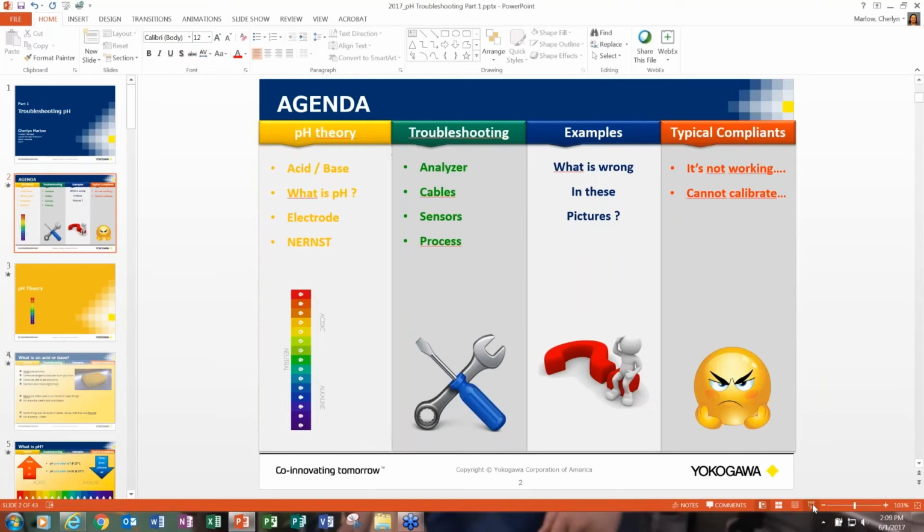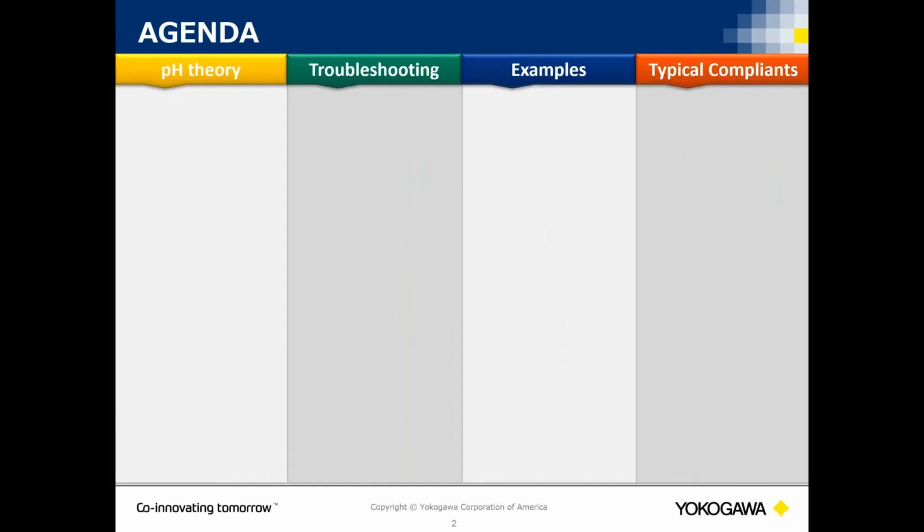Just to start off, to make this training presentation real live examples for you guys, I have my equipment, and the terms I'm going to use are generic depending on whose instruments you have. So we're going to focus on how do you know for sure, and how do you troubleshoot, that the pH measurement you're reading during your cleaning cycles is working, is accurate, is reading correctly, your analyzer and your sensor. And then the ORP system can be pretty much done the same way because remember they use the same reference.